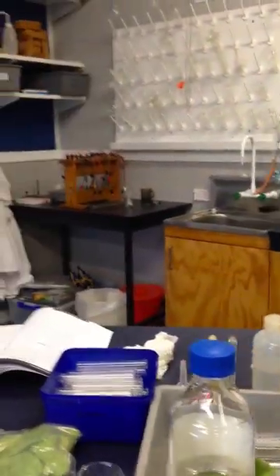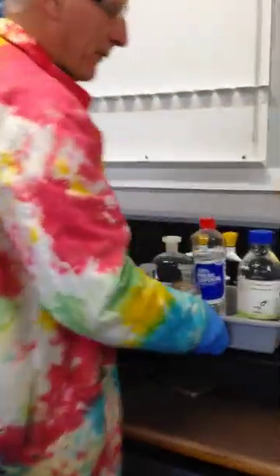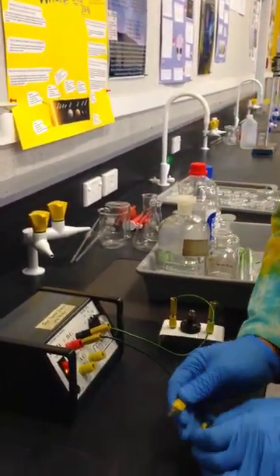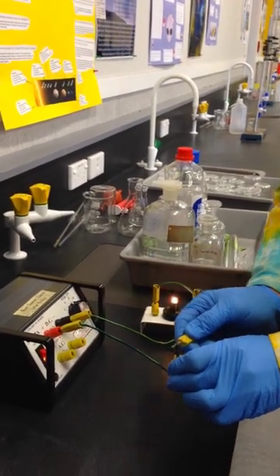Right, so I'm just going to take these chemicals over here. I've got some little beakers. I'm going to put a small sample of each one in the beaker. I've got the power pack set up, and as you can see, when I touch the two ends together, the light bulb glows, indicating an electric current.